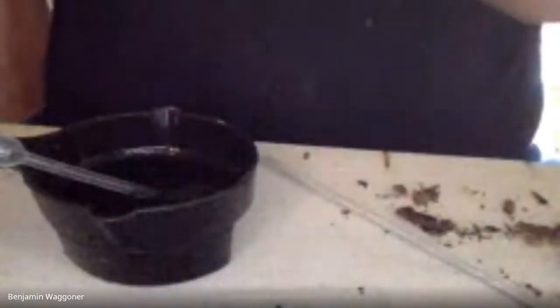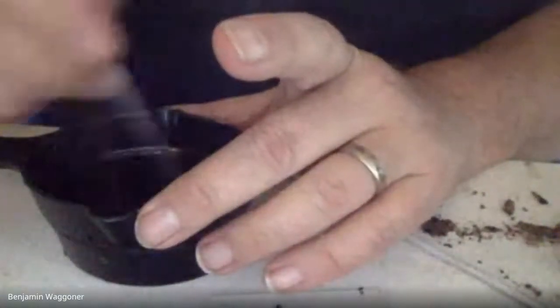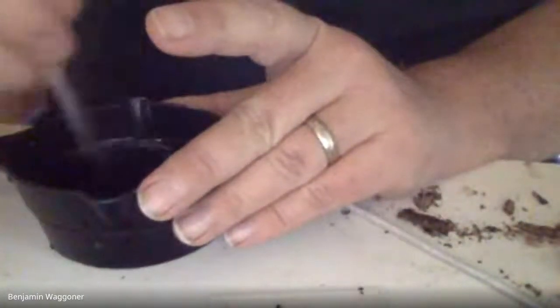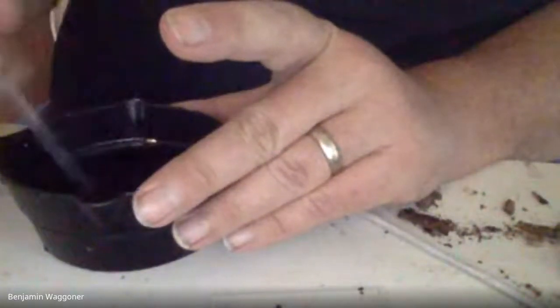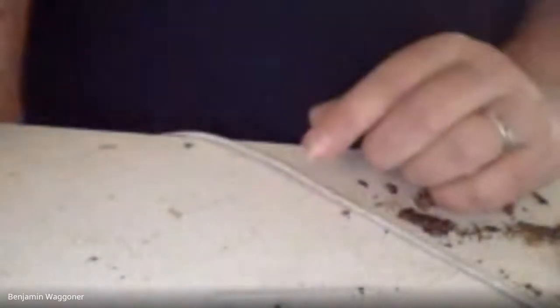And it's not going to work as well as the stuff we'd normally use in the lab that has glucose and magnesium chloride and things like that. It's not going to work as well as insect ringer solution would, but it'll do. And by the way, you should probably mix this up before you squish your bug. I should have done that. Bad professor, no cookie. So we squish that up, and I'm going to put 1 drop on this gut. And I'm going to put a cover slip on top.